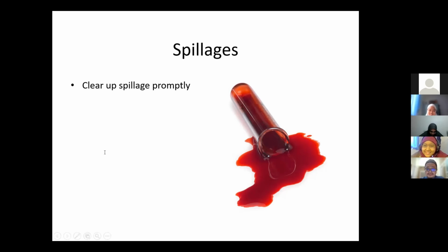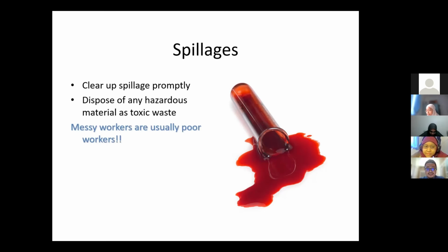So clear up spillage promptly. Dispose any hazardous material as toxic waste. Remember, messy workers are usually poor workers. We don't want any UIA student to be labeled as poor workers. Yeah, nanti kita ajarlah how to work in a systematic manner, appear to be a very clean person.